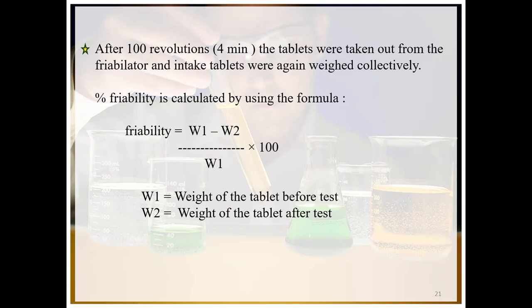After 100 revolutions, which are completed in 4 minutes, the tablets are taken out from the friabilator and are again weighed collectively.